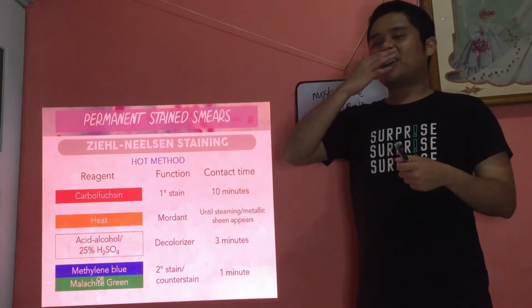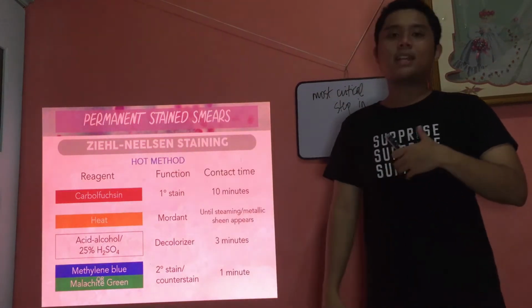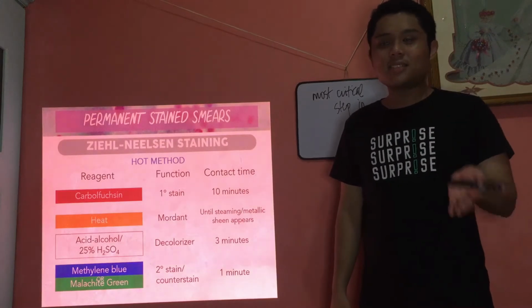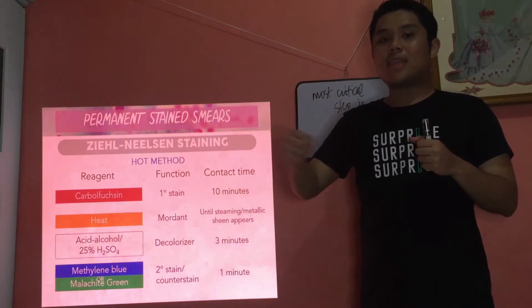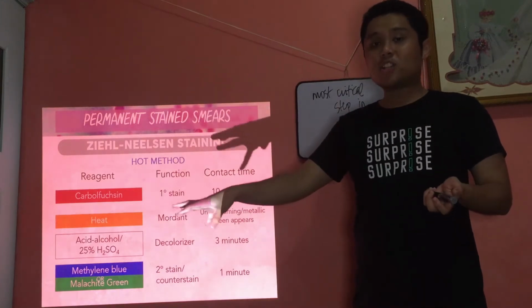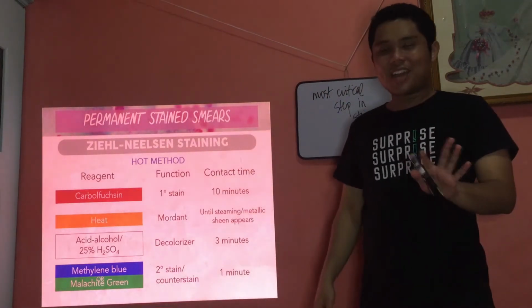So it's able to take hold of carbolfuchsin. That's true acid-fast. If it's non-acid-fast, when we add the decolorizer, the relationship between the carbolfuchsin, the mordant and the organism is weak, because the organism doesn't have long-chain fatty acids. So, of course, it will not be able to hold on to carbolfuchsin that strongly compared to the true acid-fast. When we add the decolorizer, the carbolfuchsin will be washed out, and when we add the second stain, that organism will take up the secondary stain. I hope that's clear.